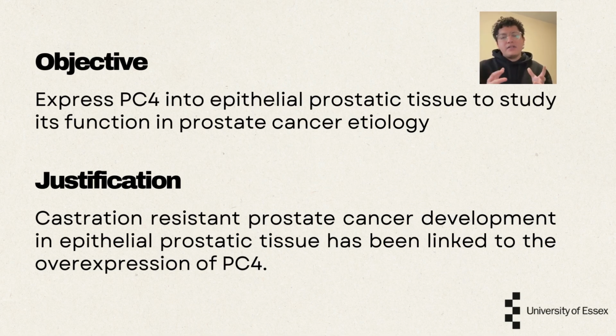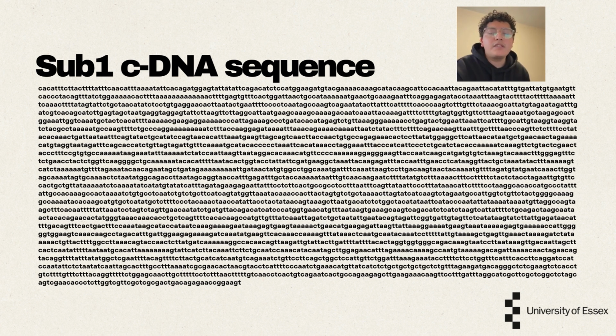Why? The justification is that PC4 has been found to be an important factor in the development of castration-resistant prostate cancer. Also, in the development of metastasis in the same disease. The positive cofactor 4 or SUB1 cDNA sequence is shown here.